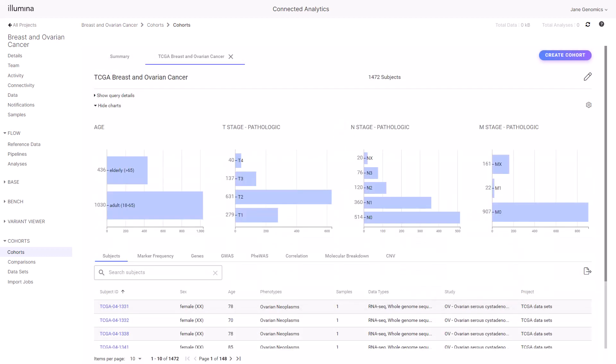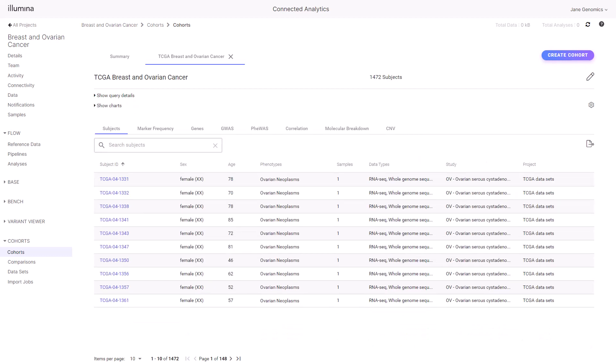This cohort has a diversity of attributes and frequencies. Use cohorts to find biomarkers that are distinctive for different stages. Select Hide Charts to view the Subjects tab.